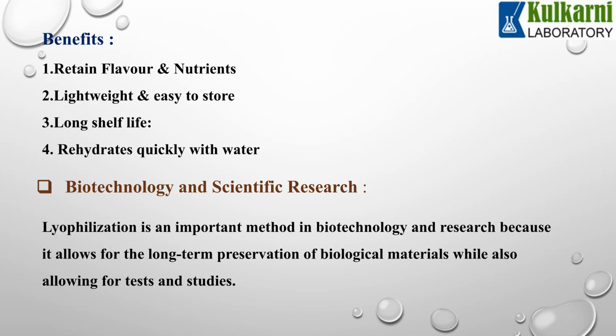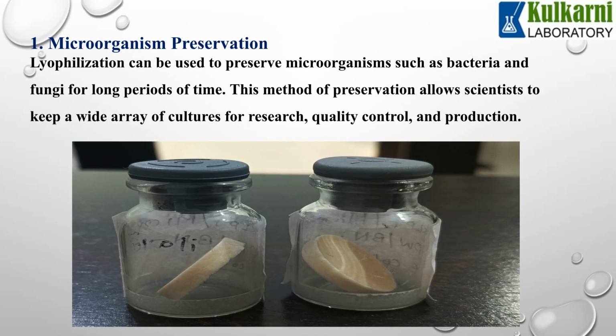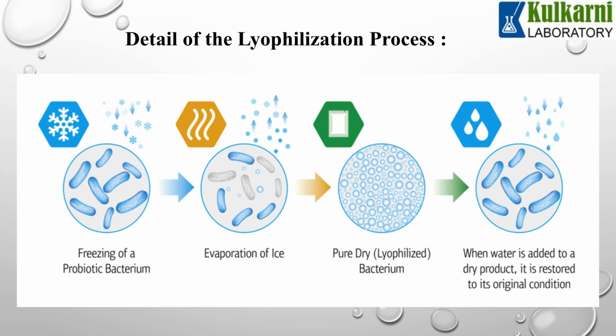In biotechnology and scientific research, lyophilization is important for the long-term preservation of biological materials, supporting numerous tests and studies. Lyophilization is effectively used to preserve microorganisms like bacteria and fungi for extended periods. This preservation method is essential for scientists, enabling them to maintain diverse cultures for research, quality control, and production purposes. The process detail for microorganisms involves freezing a bacterium, followed by the evaporation of ice. This yields a pure, dry, or lyophilized bacterium. When water is later added, the dry product is restored to its original condition.